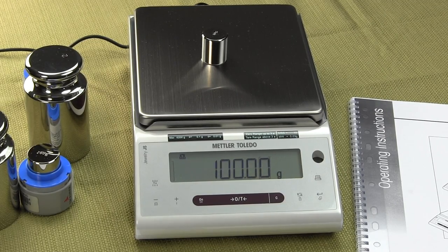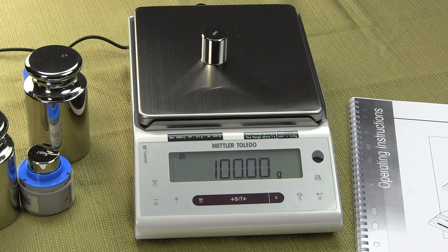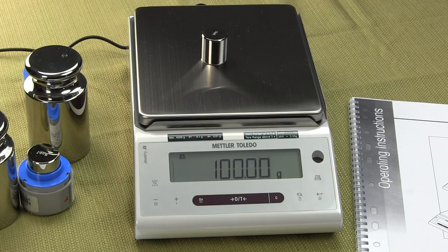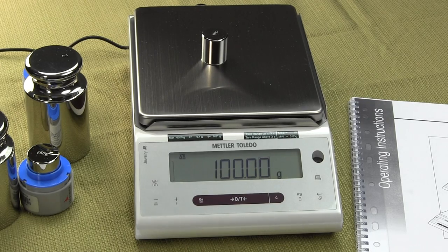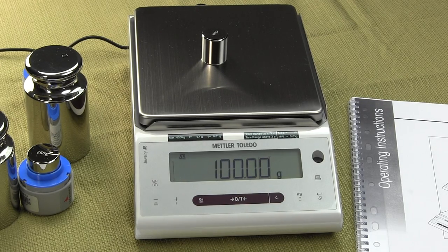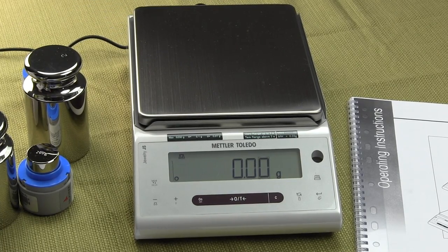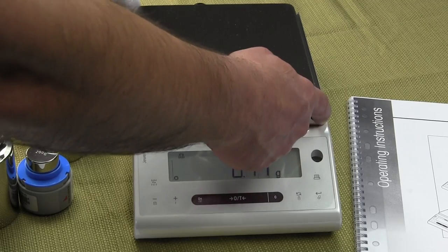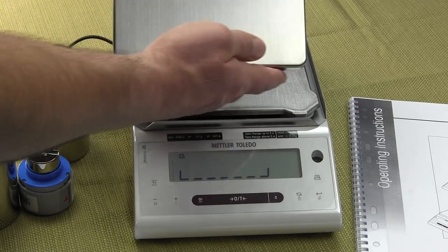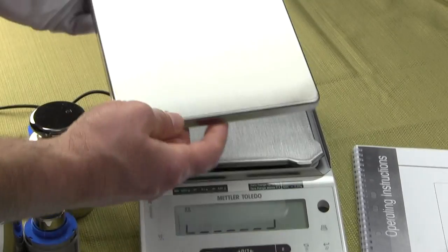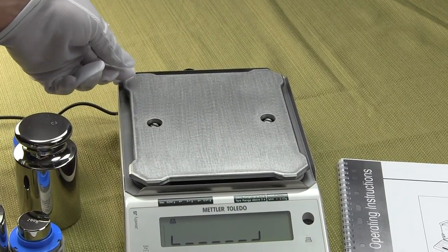The balance itself has a high quality aluminum housing, so you have no flexing at all of the body itself. It has a small footprint and the overall size of the balance is 11.4 by 7.25 inches. Your platform is a nice heavy duty stainless steel platform and very simple design all together.